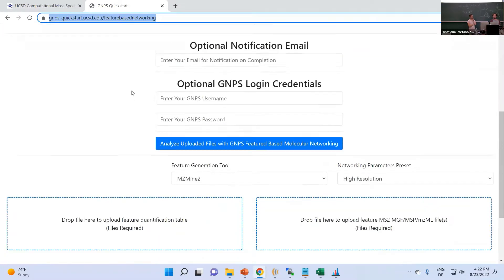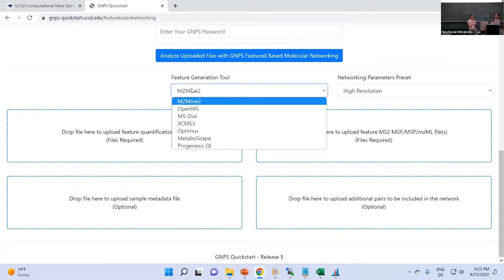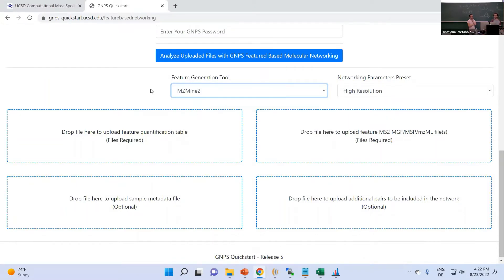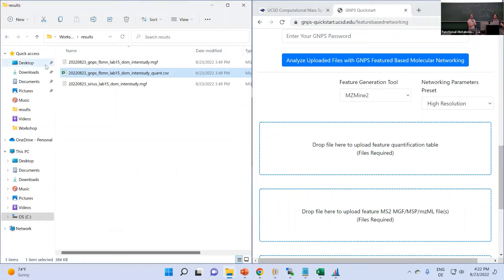Scrolling down, I can select the feature finding tool. It says MZmine2 but it's actually the same format, so we choose MZmine here. There are four dropdown boxes. On the left side you can see the feature quantification file, or table file, which is required.